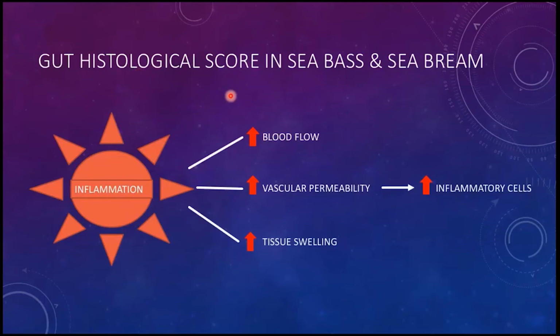It helps to be more precise in the type of tissue response, but it also helps to have numbers that, to be honest, are always helpful to compare populations of fish. So let's focus on, you can hear me saying inflammation, inflammation, inflammation.